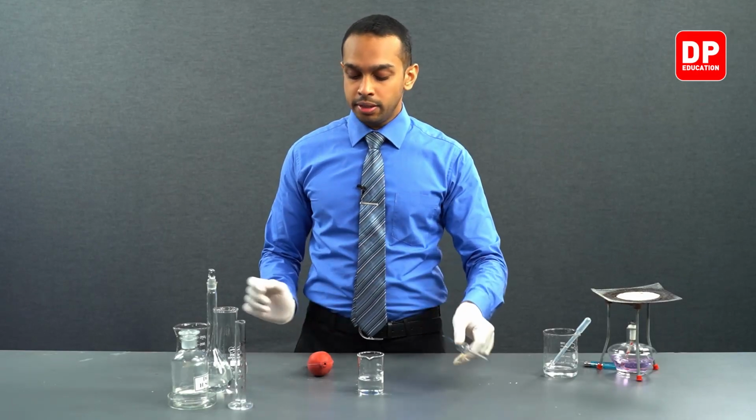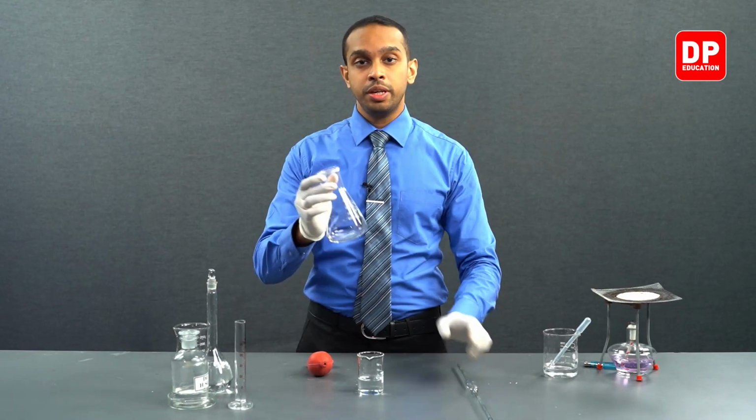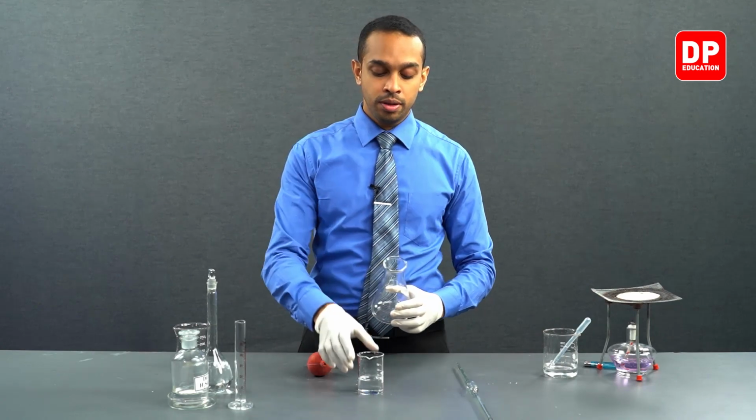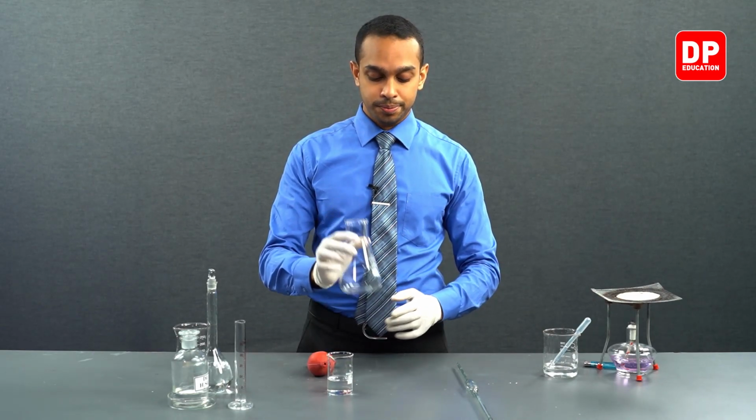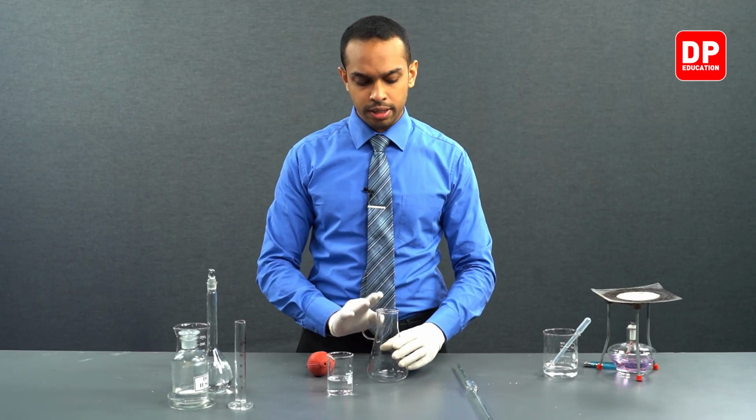We'll use this pipette to transfer exactly 25 cubic centimeters of potassium oxalate into our titration flask. So we will have our titration flask here.